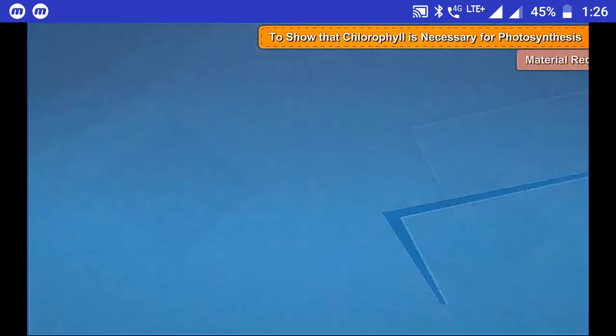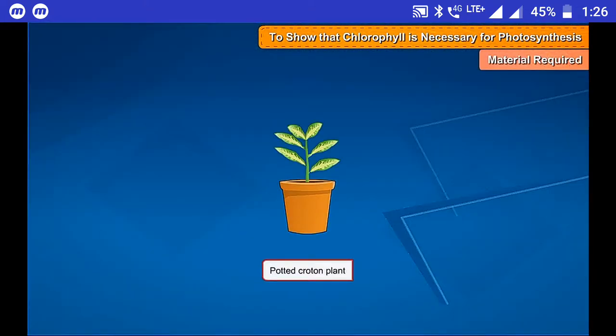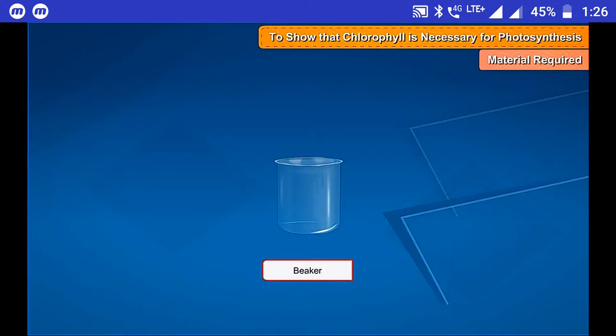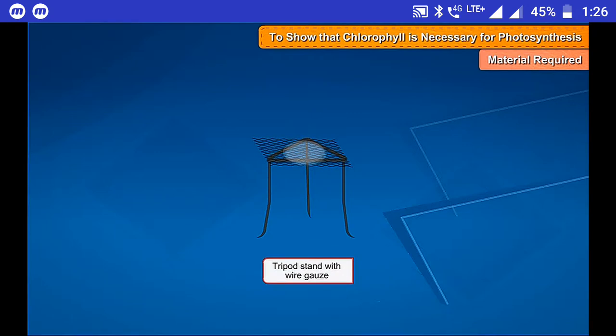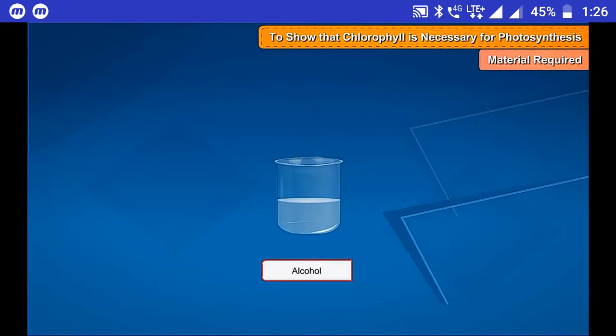Materials required: Potted croton plant, iodine solution, beaker, test tube, Bunsen burner, tripod stand with wire gauze, alcohol, and water.